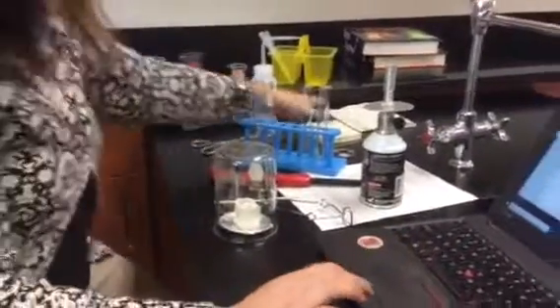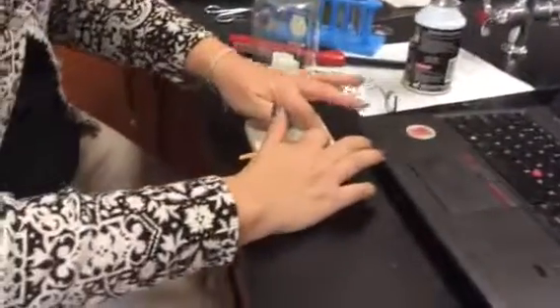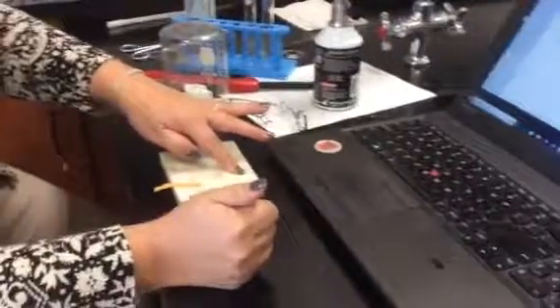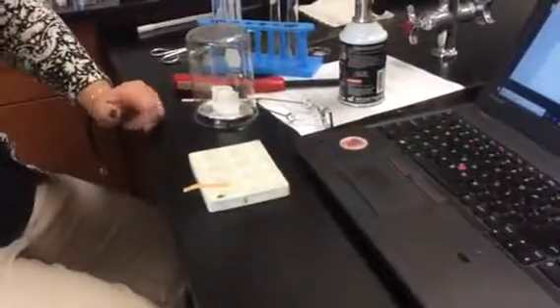And then the last one is you'll pick one more clean well plate, and you'll add potassium iodide and lead nitrate in there, and then you'll see what happens. And that is all. Thank you.